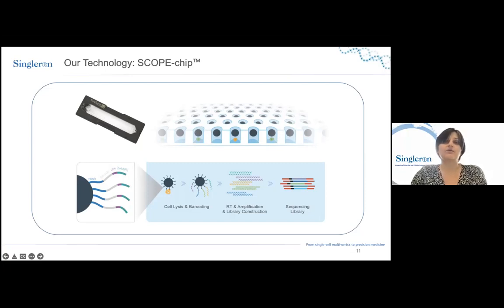What you do with this chip is inject a single-cell suspension into it, and the single cells fall into the individual microwells gently by gravity, and they get partitioned. We often use this term partitioning in single-cell sequencing experiments, meaning that these single cells occupy individual compartments and are separated from each other.